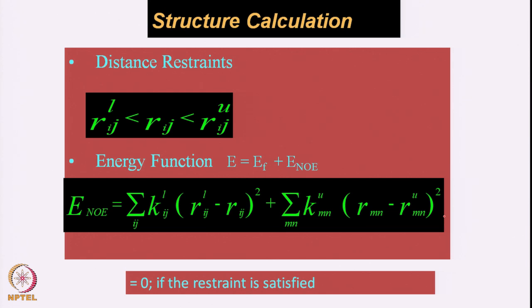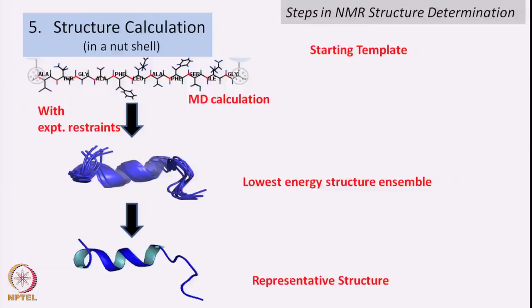So, essentially it solves some of those equations. It minimizes the distances and it minimizes the energy. So, by using this NOE energy, finally by minimizing the energy it gets the minimum energy structure. So, one thing to notice here, NMR never gives you a unique structure, it gives you an ensemble of structures, those which have minimum energy. If you look at any of the protocols that are used, either CYANA or Xplor-NIH, that gives you either a 10 ensemble structure or a 20 ensemble structure. These are minimum energy structures obtained by this distance geometry simulated annealing protocol.